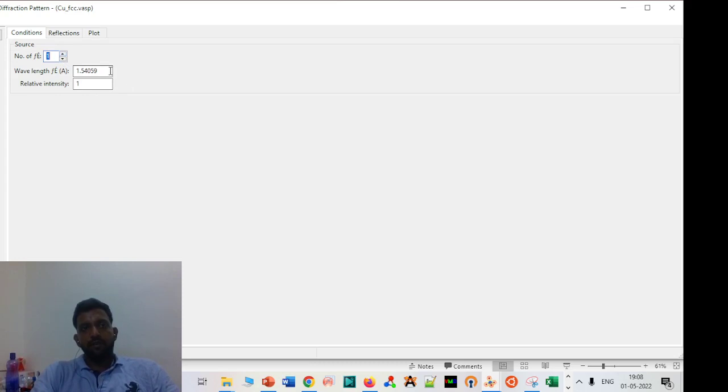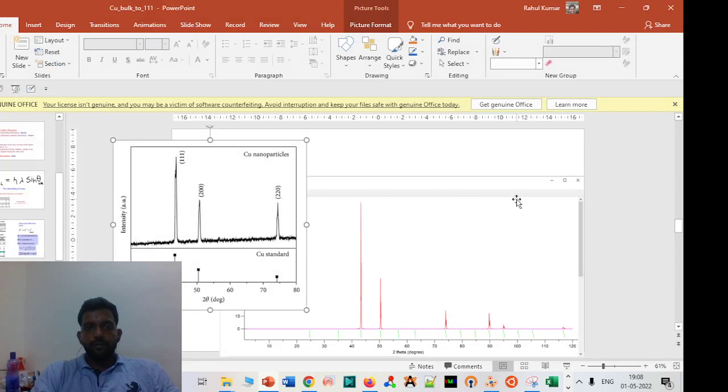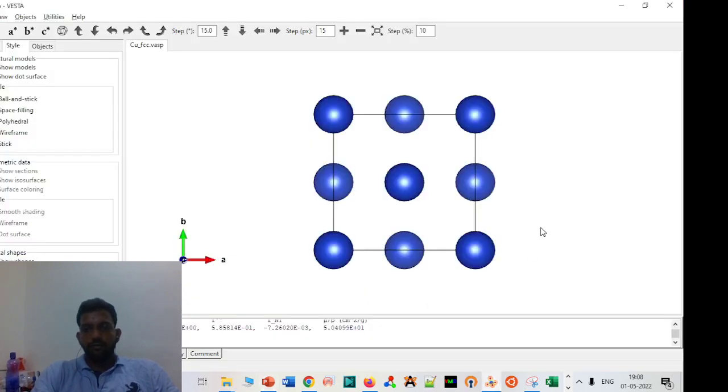This is basically copper K alpha radiation, 1.54 I think. So you can also check it, and I hope this is one more addition to your skills to use VESTA. So definitely it will help. It's a short video, I just wanted to cover this topic. So hope you will enjoy.